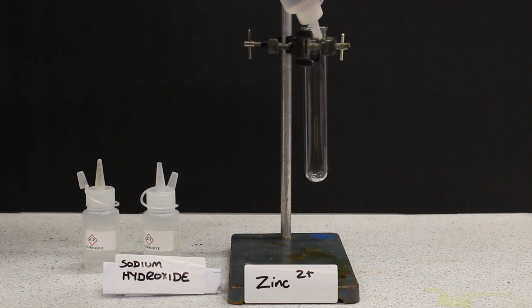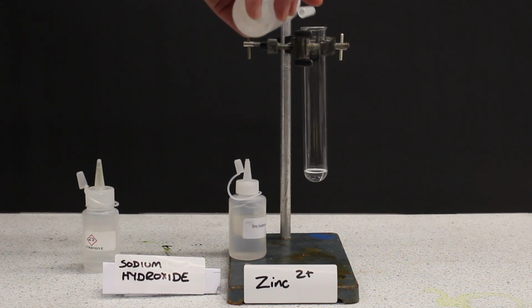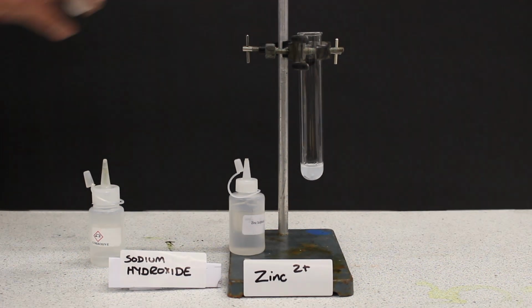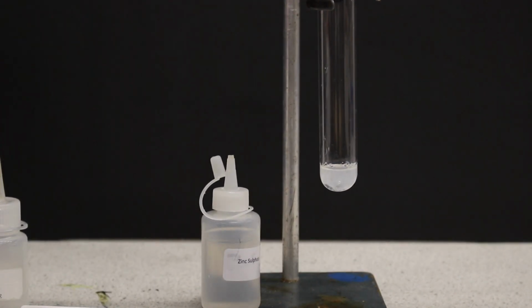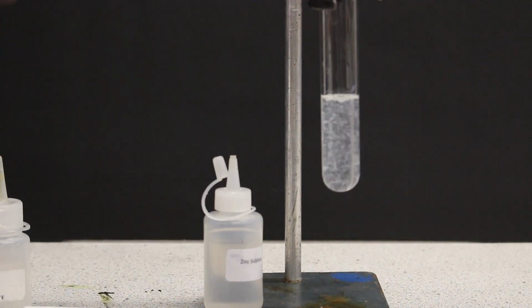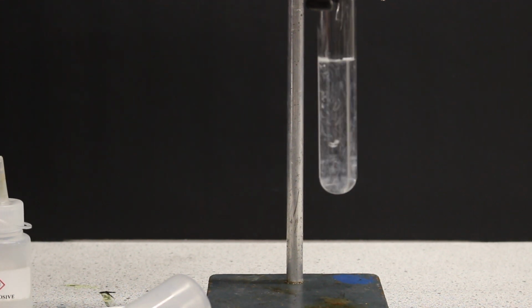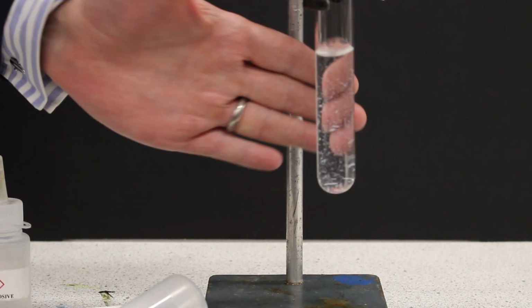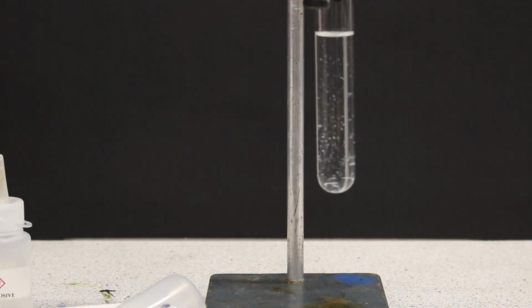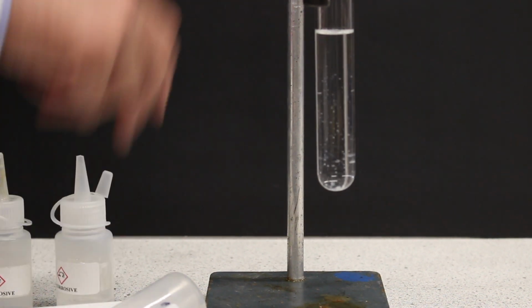So just to finish up, we're going to do one further experiment where we put a few drops of Zn2+ solution into a test tube, and we add a few drops of aqueous sodium hydroxide, and this time we get a white precipitate. And when we add excess sodium hydroxide, this precipitate will start to dissolve. We'll add a little bit more here because it's starting to dissolve, but it's not fully dissolved yet. Then we're going to add a bit more aqueous sodium hydroxide, and we may need to shake it up to get the precipitate to dissolve.